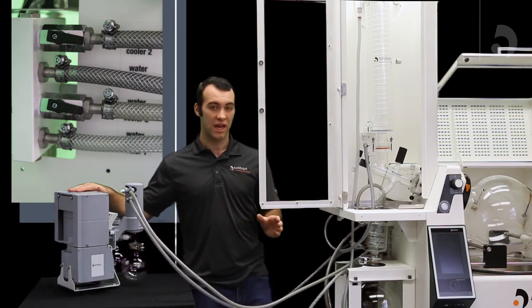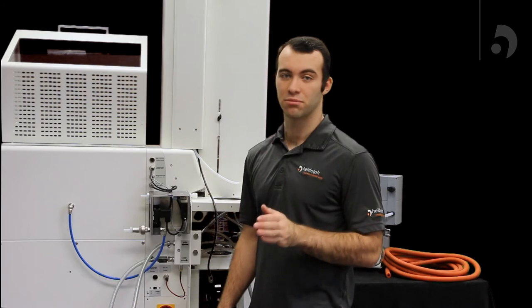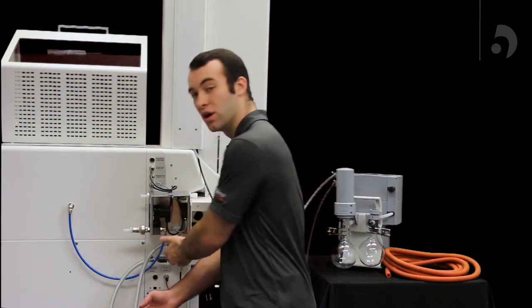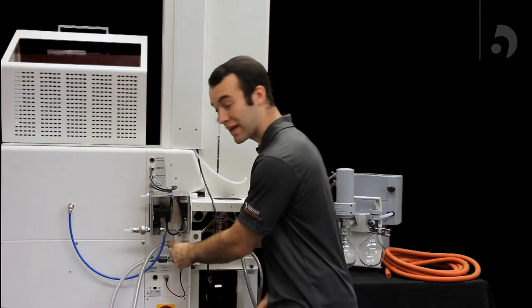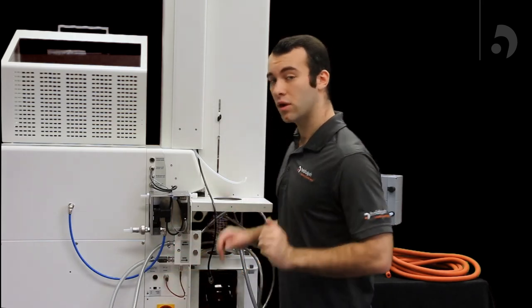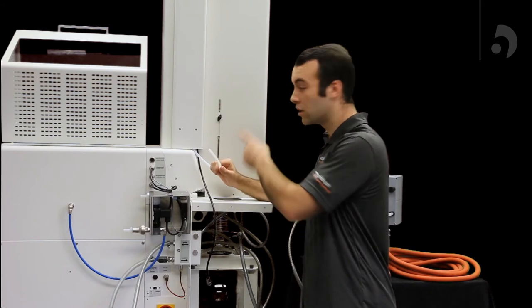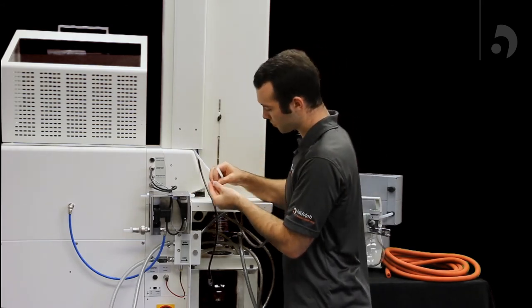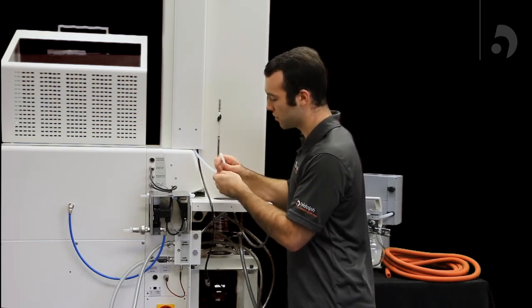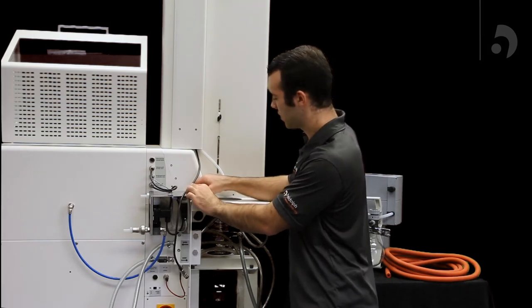Now I'll show you how to connect your vacuum and your chiller tubes to the industrial. Connecting your chiller to your industrial unit is fairly simple — the out portion of your chiller will connect through tubing to the in portion of your unit, and the out portion of your unit will connect to the in portion of your chiller. Remember to use your O-ring clamps to prevent any leakage. Then we're going to connect the vacuum from our condenser to our unit. The PTFE tubing is connected to the vacuum cap, and we're now going to connect it into the unit using a compression fitting and a ferrule. Slide your ferrule onto the PTFE tubing after your compression fitting, then insert it into the vacuum out and screw it on tight.